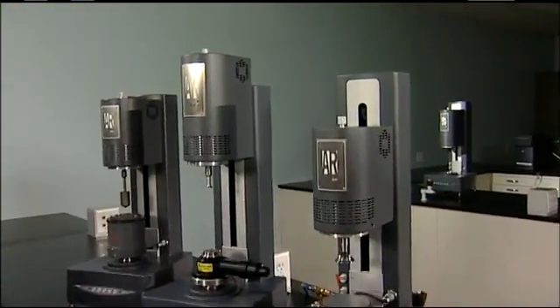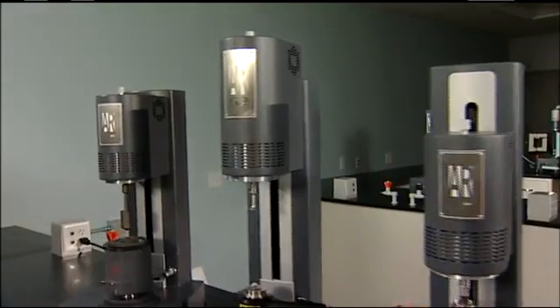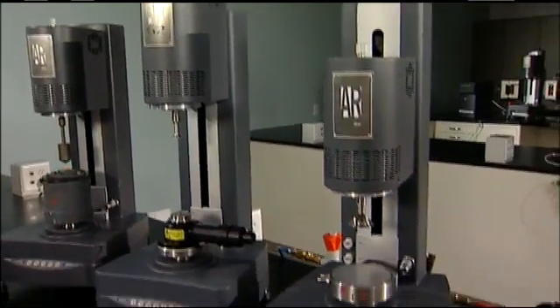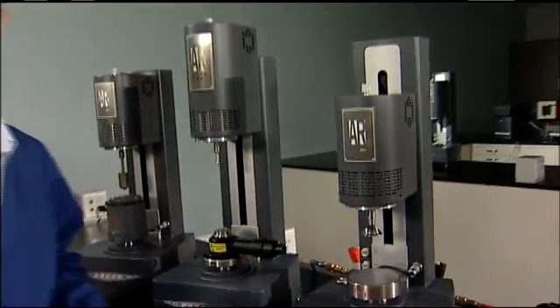By the way, TA is uniquely qualified to discuss the strengths and weaknesses of both designs because we manufacture both — the Aries G2, and the world's best-selling low-inertia single-head rheometers, the AR series. That's the TA difference.